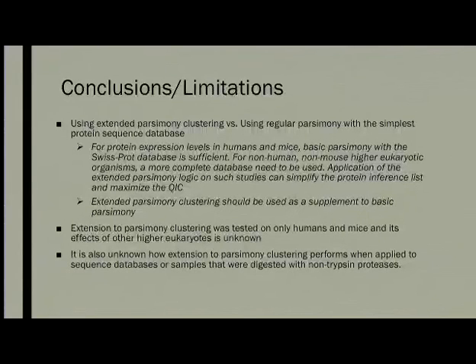So finally, in conclusion here, how can this clustering algorithm be practically used? Do you want to use the extended parsimony clustering as part of the routine processing pipeline, or can we use a regular parsimony logic with the simplest protein sequence database? Based on what I have seen so far and what I've showed you, my recommendation is that for protein expression studies in humans and mice, the basic parsimony logic with the SwissProt database should be sufficient. I've showed you that the SwissProt database has a good balance between completeness and redundancy.